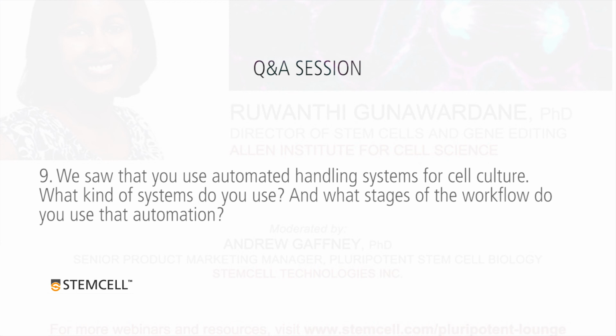And what they're using it for right now is to seed the cells onto their glass imaging plates, so that they're very consistent. What the robot offers is the kind of reproducibility and consistency that a human hand cannot. So that's what they're doing. The actual culturing of the cells is still done manually, but we are, of course, starting to think about that, at least for the microscopy piece of it, to make this as automatable as possible.